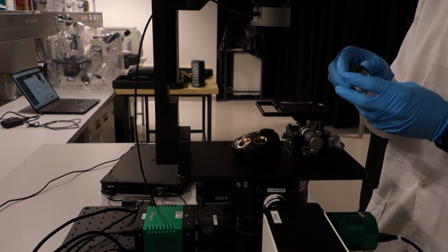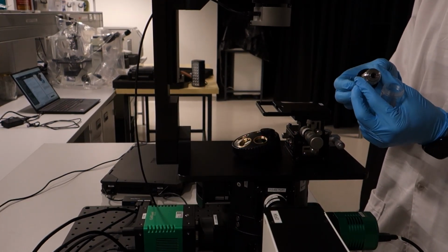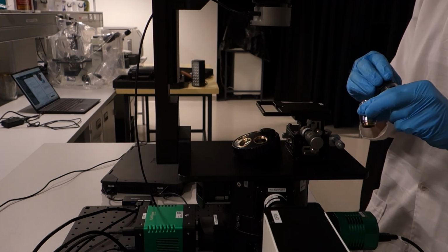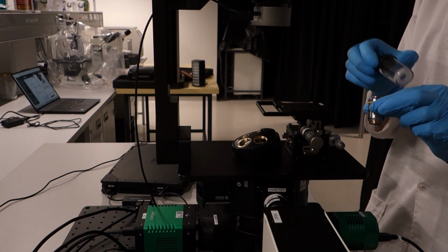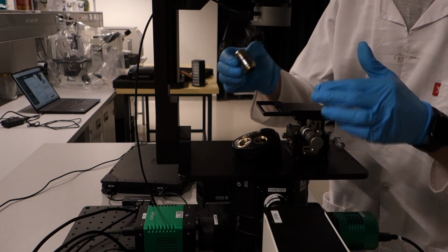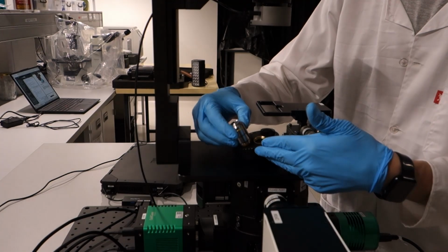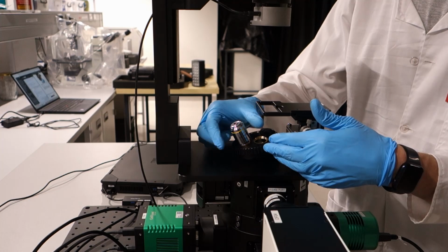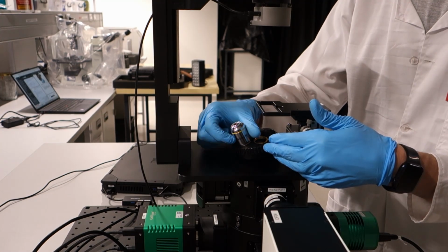Insert an objective lens into the objective turret. It is recommended to start with a low magnification objective and progress to higher magnifications. Do not use immersion oil with any objective lenses except the supplied 100 times oil objective.